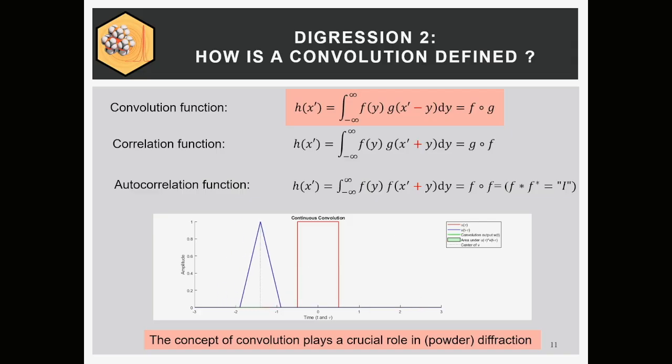And if you remember your first or second math course, they probably told you, if you have a rectangular function and you convolute it with itself at least 4 or 5 times, you get a perfect Gaussian function, okay? This is a typical example, for example, if you have a photometer. So you have the slit is rectangular, and then you have, let's say, a more or less triangular peak, or let's say you have a Gaussian peak and you move it over, then these two functions are blended, they are convoluted, which usually means that if the slit is open, the whole thing gets broader.